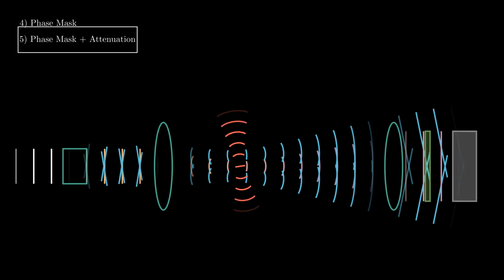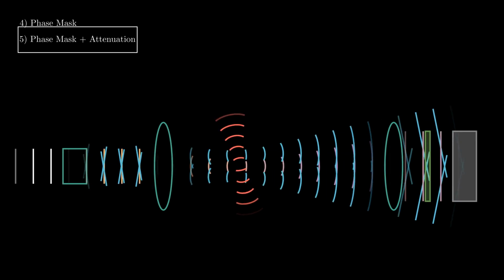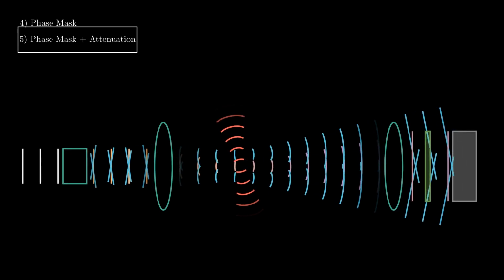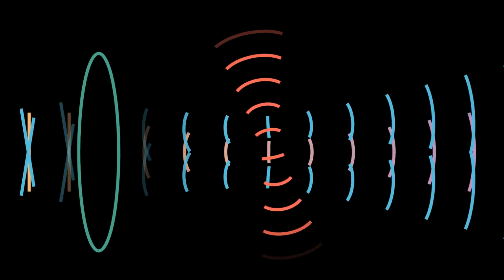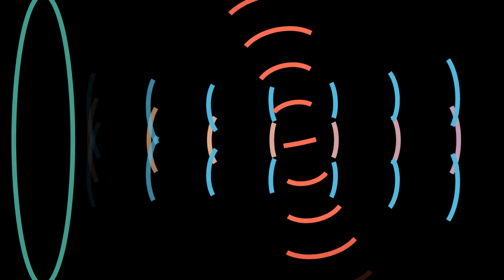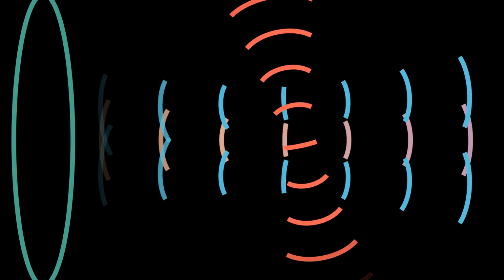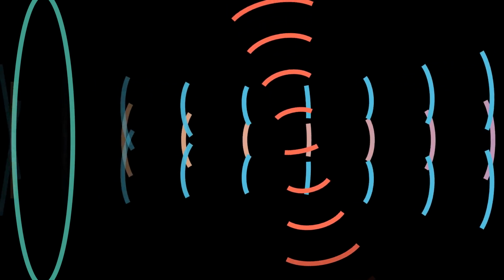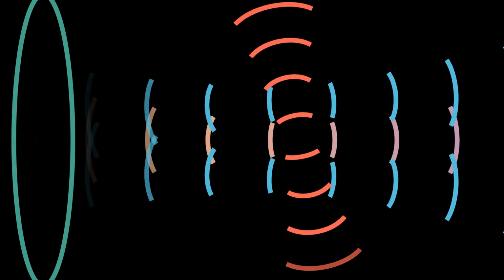Let's see what happens when we rotate the laser slightly and put two different wavelengths of light. The red lines of the laser represent nodes of high intensity. Since there are now two different wavelengths, the intensity beats, and the intensity nodes propagate in space. Looking closely at the intersection point, we see that one can choose the angle of the laser tilt such that the electron's wavefront surfs on the intensity nodes. Each electron's wavefront experiences a constant intensity, which is a different intensity than that of the following wavefront.